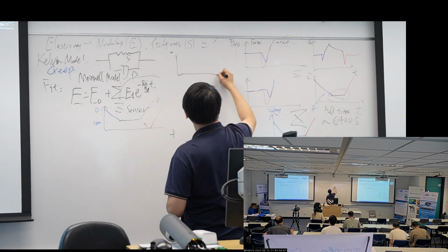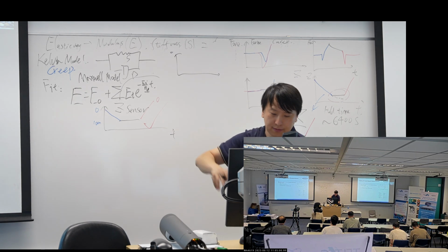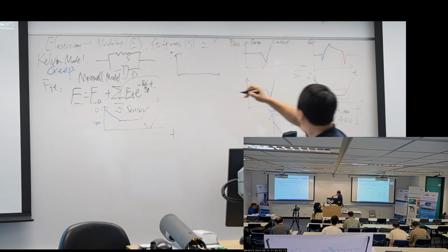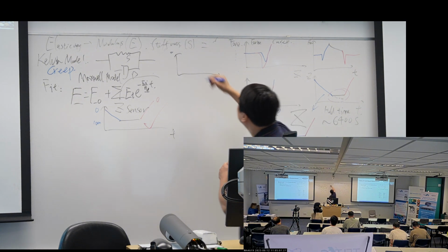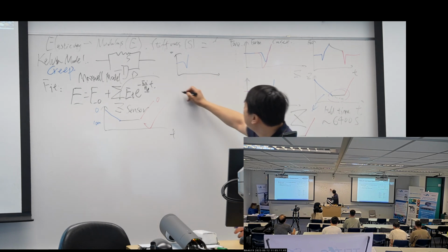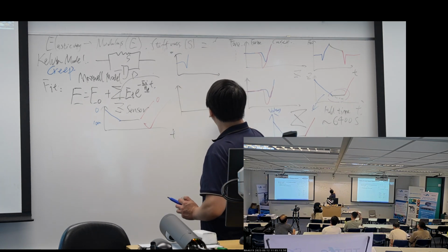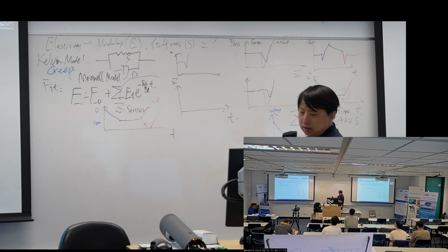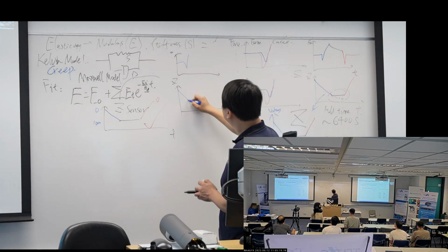So that's our original force curves. So our force is something like this, and my Z against the time, something like this.